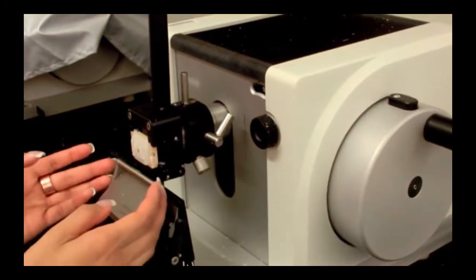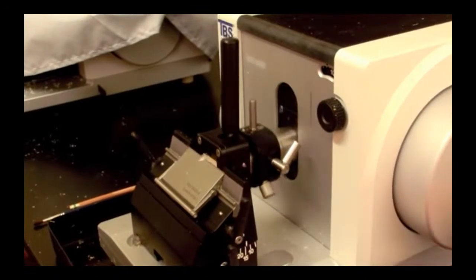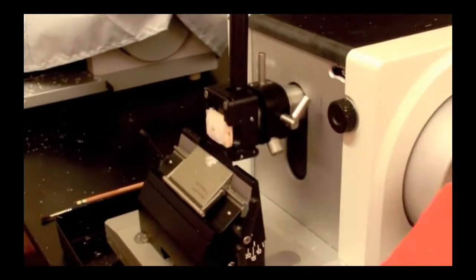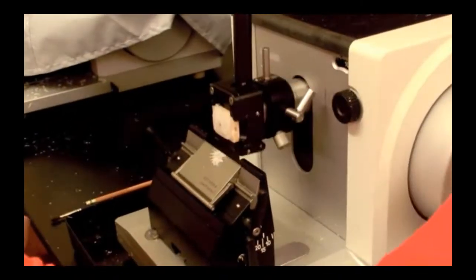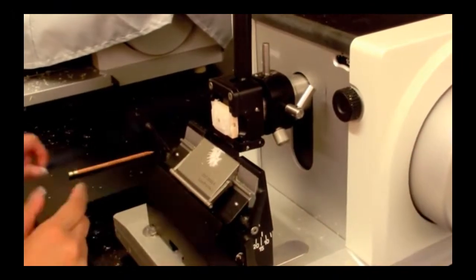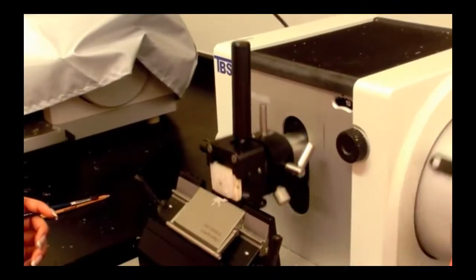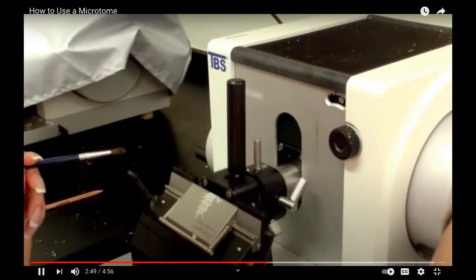Unlock the wheel on the right by pushing the pin button down. Next, place both hands on either side of the finger guard and pull it down so as to reveal the microtome's blade. Remember to always lock the wheel into place when you are not sectioning. As you begin to cut into the paraffin specimen, discard all unwanted sections using a paintbrush. Be careful not to drag the brush across the blade. Continue turning the wheel until you obtain a desired section. Once you have done so, make a ribbon that contains multiple sections.